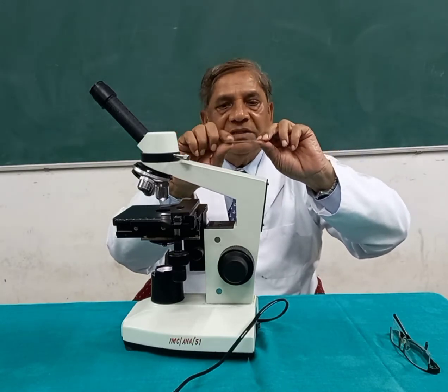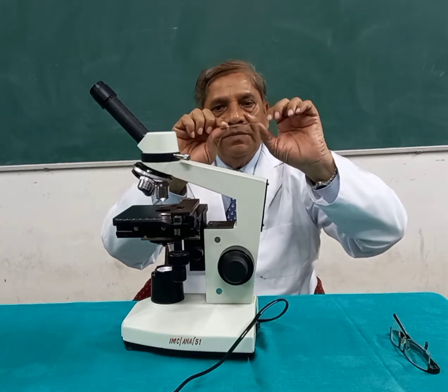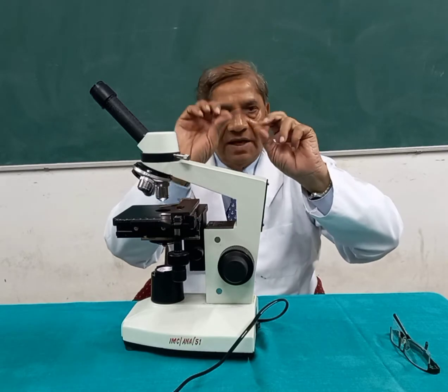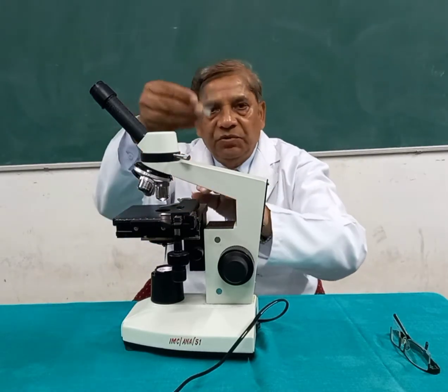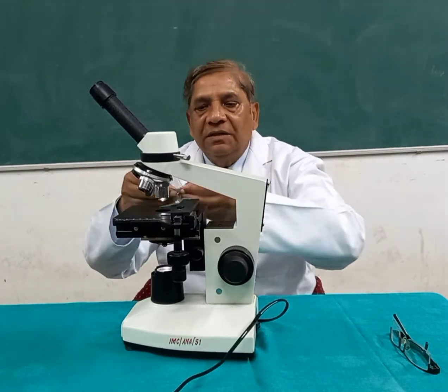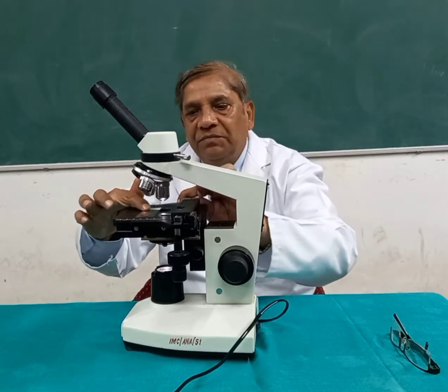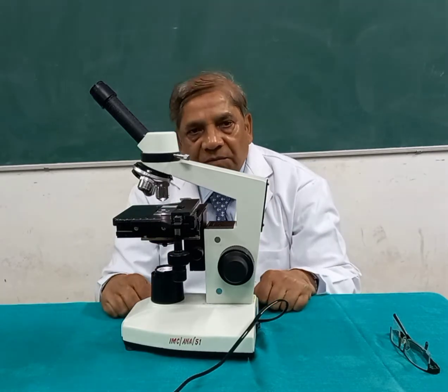If your slide does not have this label, then touch the margin of the cover slip, and you will come to know which side of the slide has the cover slip. Put the cover slip upward and put it onto the stage. I have told you in the last video that this is the stage where you can put this slide with the help of the clip. There are clips, and with the clips you can hold this slide.